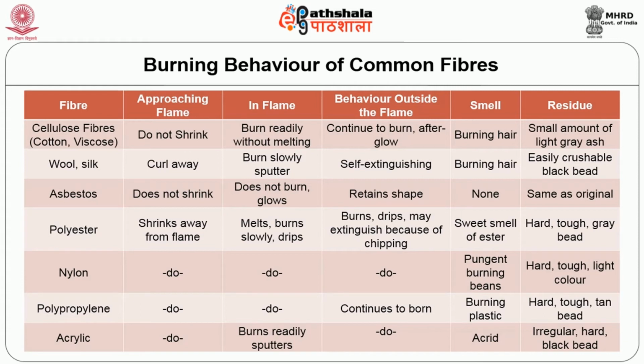In the case of nylon, it is the same as that of polyester, but the residue will be hard, tough, light color. In the case of acrylic, the residue will be irregular, hard, black bead like that of polyester. So we can identify the fiber during burning.